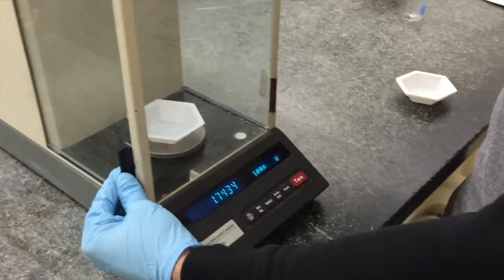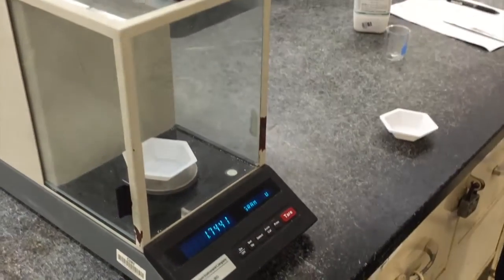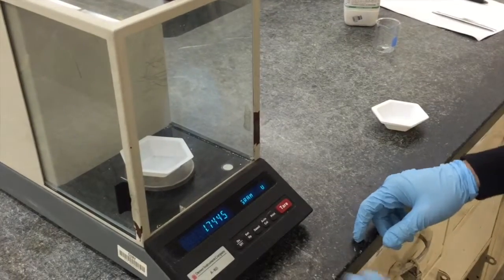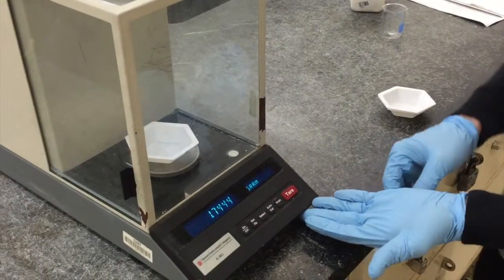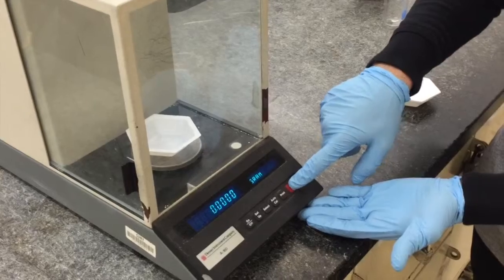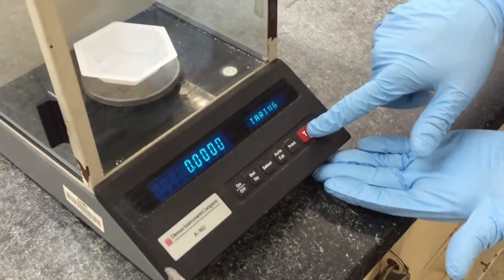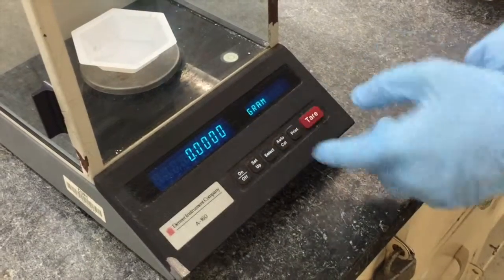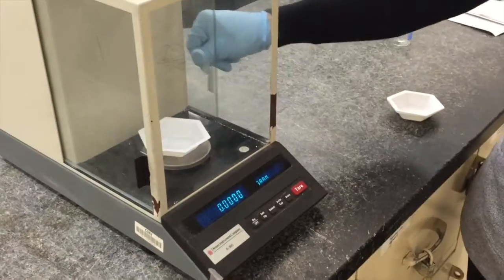Once the sliding doors are closed, press the red tear button on the right side of the device. Tearing or zeroing the scale subtracts the weight of your weighing boat from any weight measurements you take of your compound, by treating the weight of the boat as zero. Press the button a few times to ensure the scale reads zero, although some fluctuation in the last digit is normal.